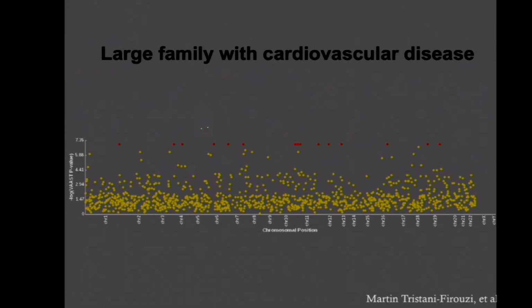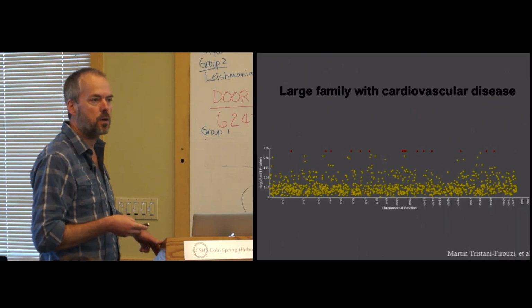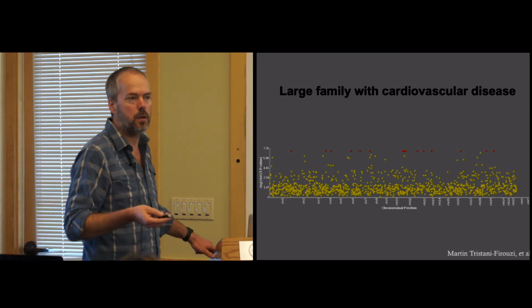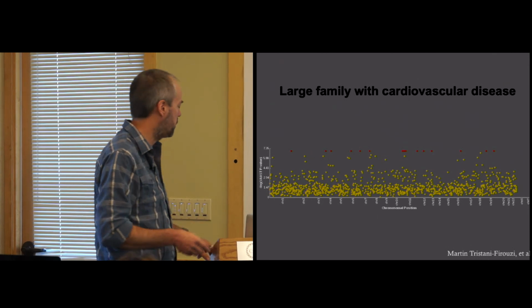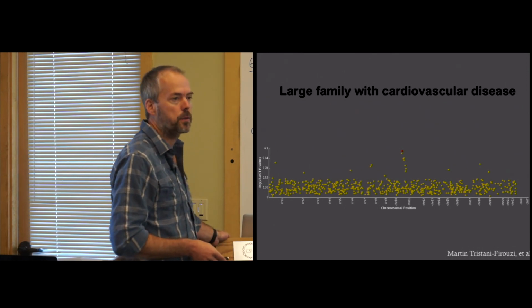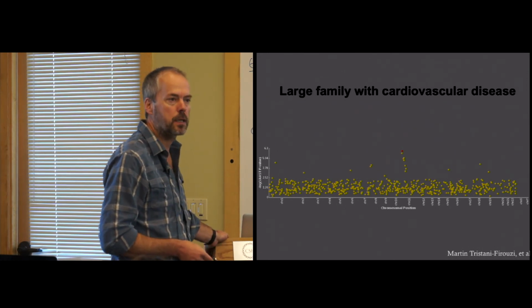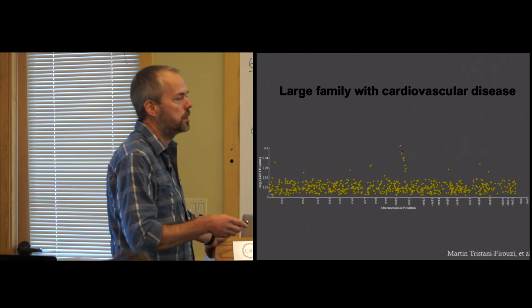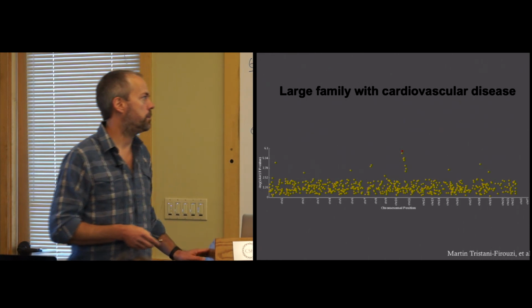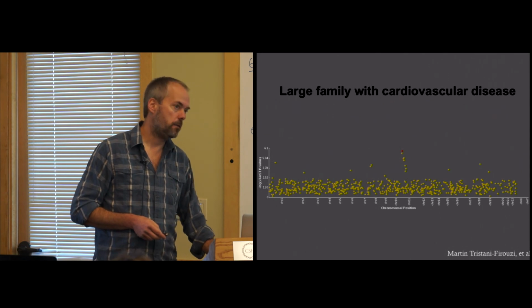And the answer is in there somewhere, and it's actually not too bad. You know, we could start going through that list. But the reason there's so many genes that have that same score at the top is because we're running this through just VAAST that knows nothing about the relatedness of these individuals. And related individuals share a lot of alleles in common simply because they're related. And so we're seeing that effect right here. When you run this same data set through PVAST that knows about the relatedness between those individuals and can calculate linkage, the top hit is the gene that they went on to show was causative. And so that's the power of pedigrees and the power of adding PVAST to the mix.